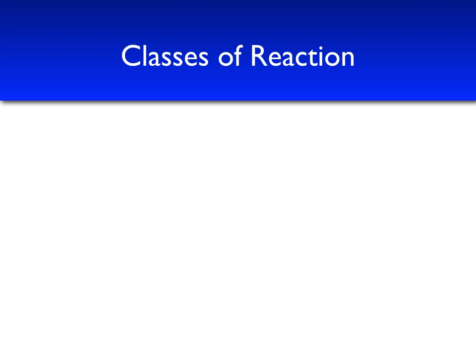In lecture, you probably discussed various types of reactions that can occur in solution. You may have gone over some basic general classifications of reaction. Let's go over 5 general classes of reaction here that you'll observe in today's experiment.